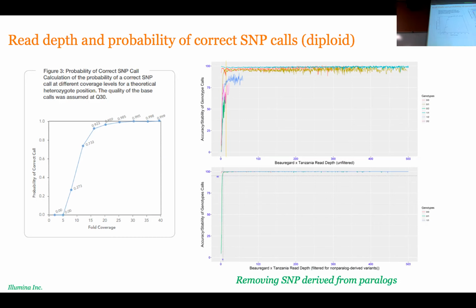So what we've done here is try to remove all the paralogs. There are two ways you can remove the paralogs. You can physically go into the genome and identify all the paralogs, but that's sort of tedious. So one thing we've done, which I won't go into much detail, is resampling, where we took the parental individuals that created a population and sequenced them really deep, to a few thousand.